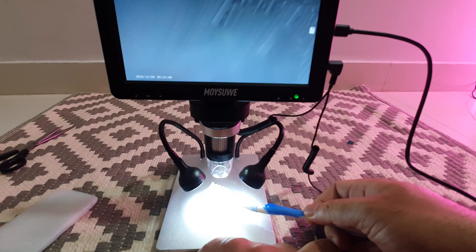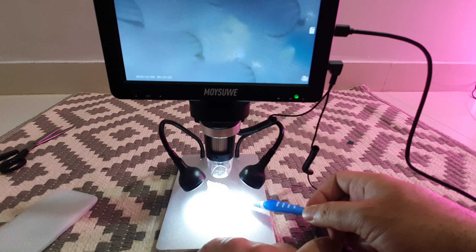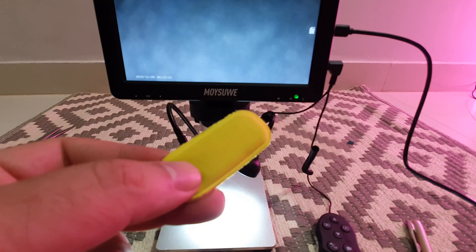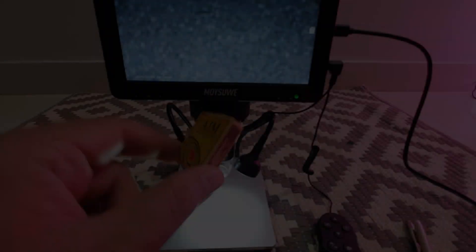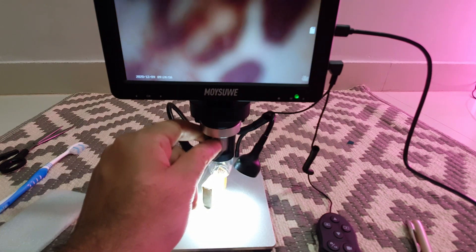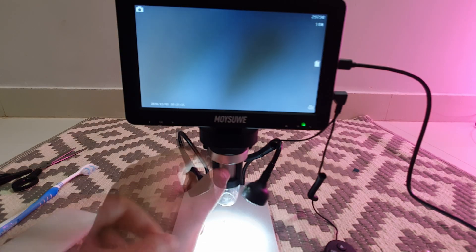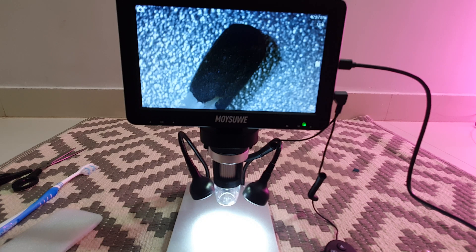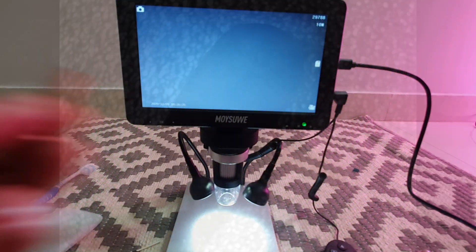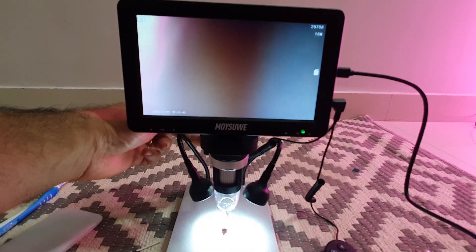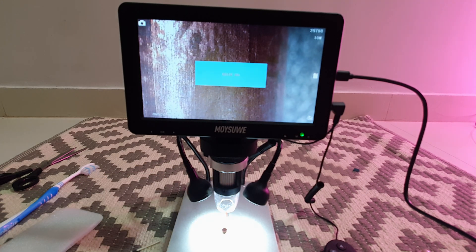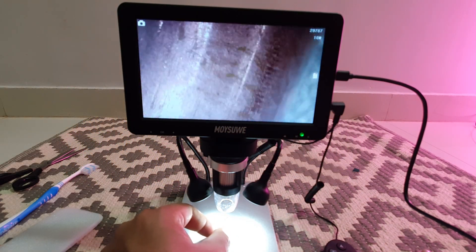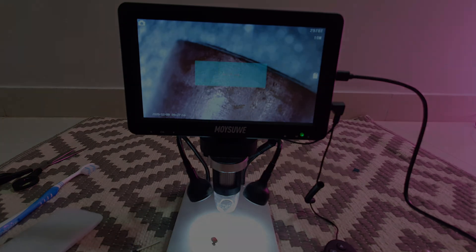Here are some of the images which I've put in. That's the bottom of the brush and you can actually see the kind of stuff there. This is the bristles. Got a small piece of memory foam there. There's a lot of rubbish which you can see. An old matchbox which I had and look at that surface, and that chemical there has worn out so badly. And the match itself. A small piece of copper and of course you can see coins with this. This is a piece of copper and you can actually see the indentations and the scratches, everything on it very clearly. Just trying to give you examples of things you can put under this.